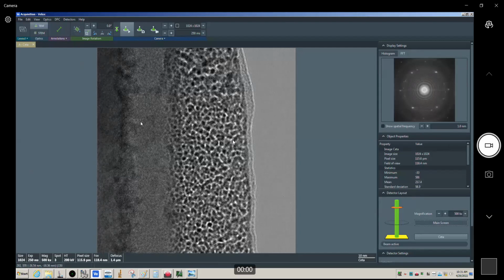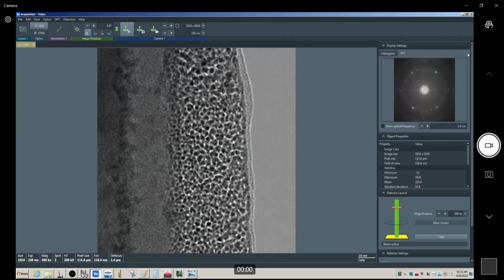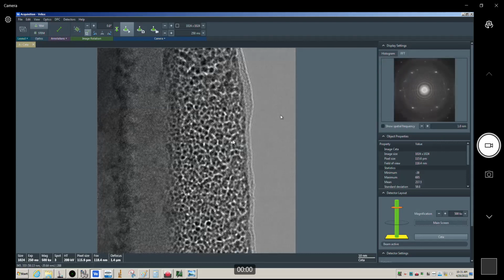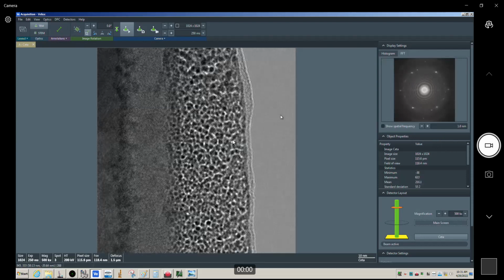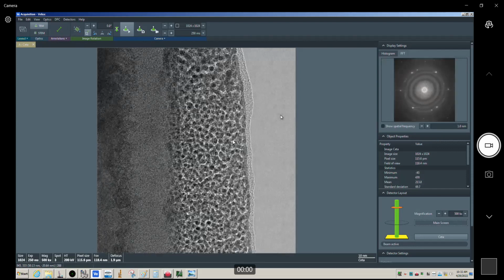This is basically amorphized silicon or indium phosphide. And then we also have amorphous signal inside of the platinum. In the FFT, as we know, we see these diffuse rings whenever we have an amorphous signal. But I can use those rings to help me figure out what my focal condition is.